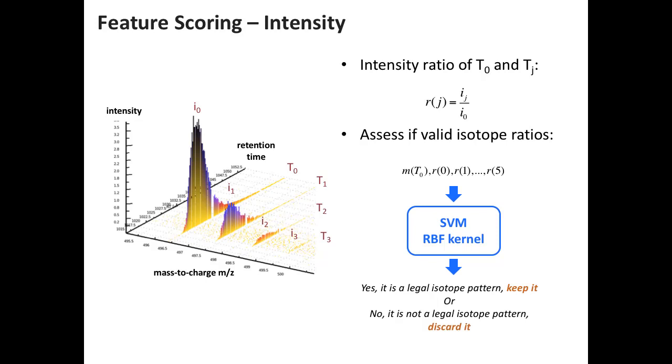What is the SVM error rate like? I don't know the number, but it was 90-something percent. So it's got a pretty decent accuracy. So we see very few losses due to the intensity variation.